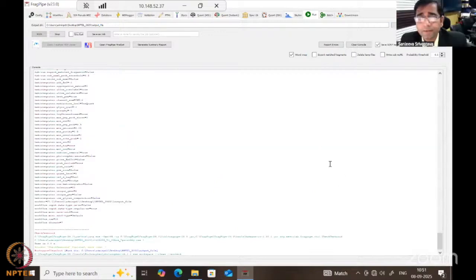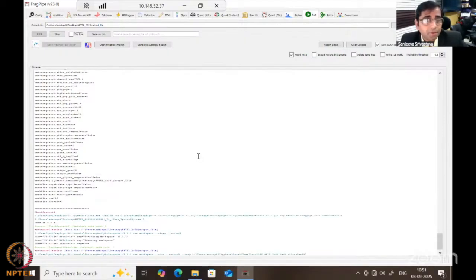All right, great. Thank you, Amit. What students can understand here is how quickly the entire process can be achieved. This file will take maybe half an hour to run. Earlier, the same files used to take several hours to a day to run, but now it can be done in less than an hour.